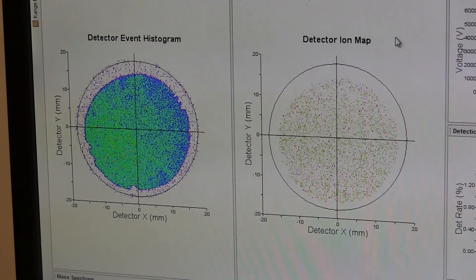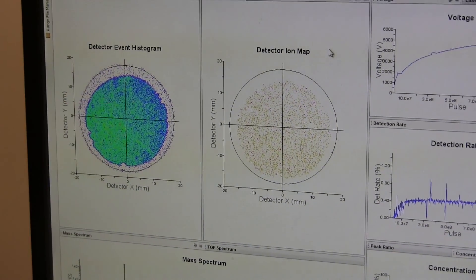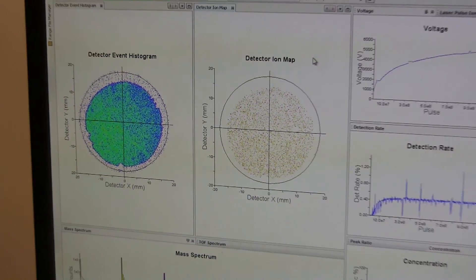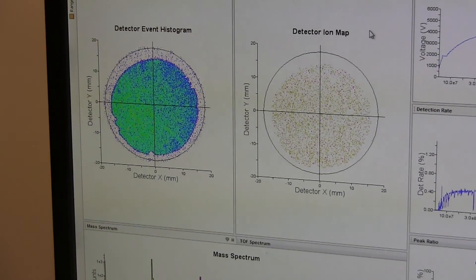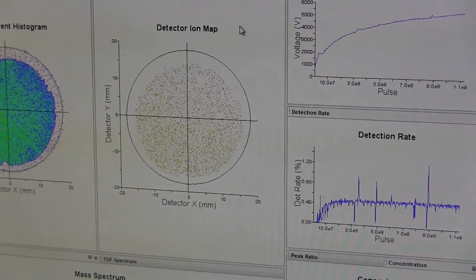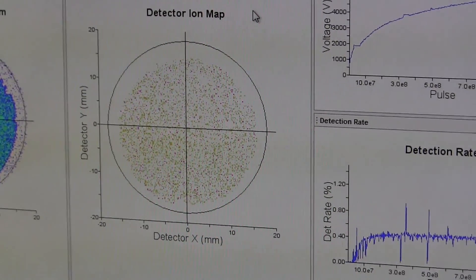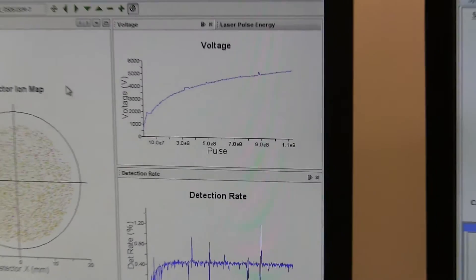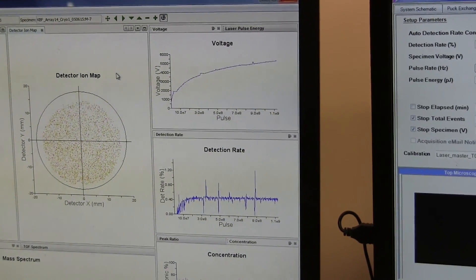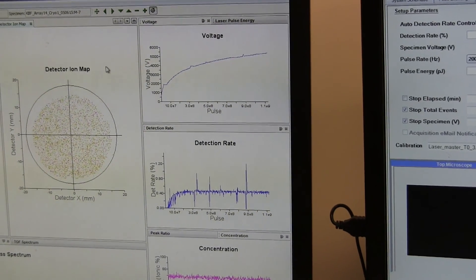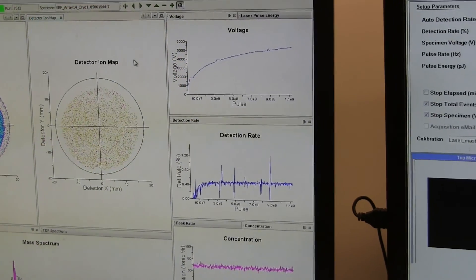So this is the screen that tells us what's going on inside the atom probe. So the histogram tells us the number of hits that the detector gets. It's basically a heat map showing where all the atoms are hitting the detector. The detector ion map tells us which specific ions are hitting that detector. So for example, the yellow dots are hydrogen atoms. The voltage curve basically tells us the amount of voltage that's passing through the tip.